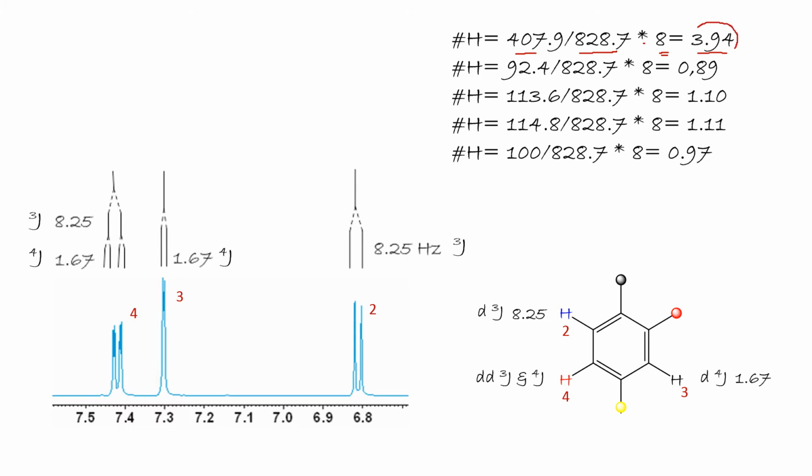That makes this peak around 4 hydrogens, and each one of the rest is 1H.